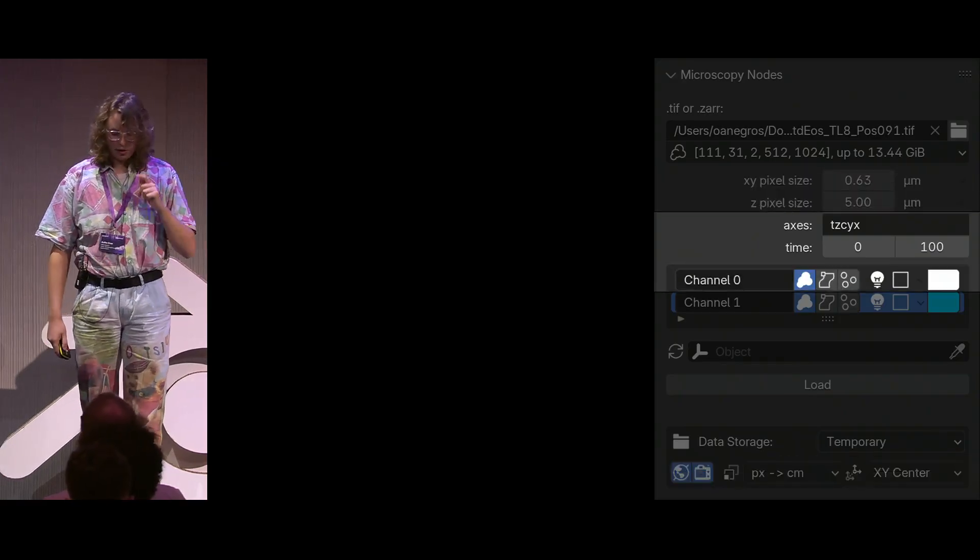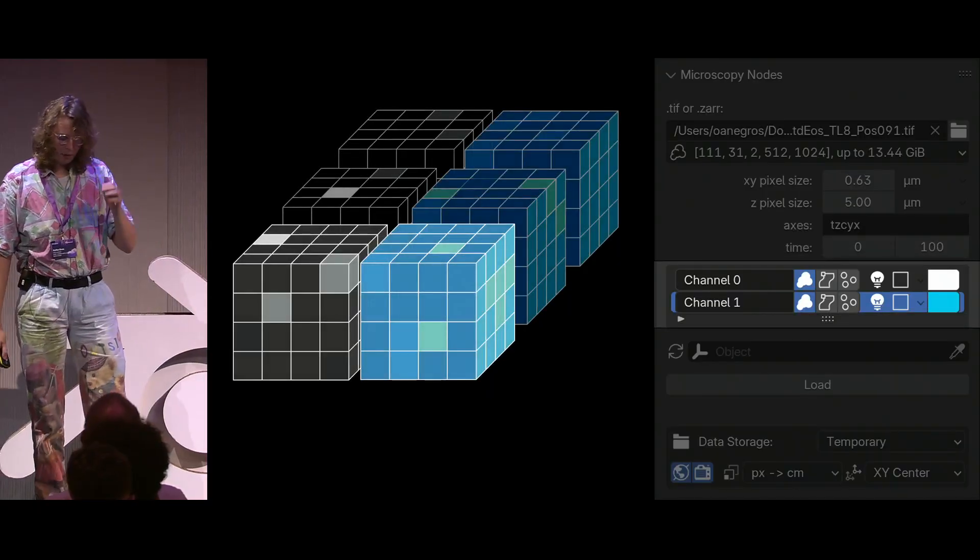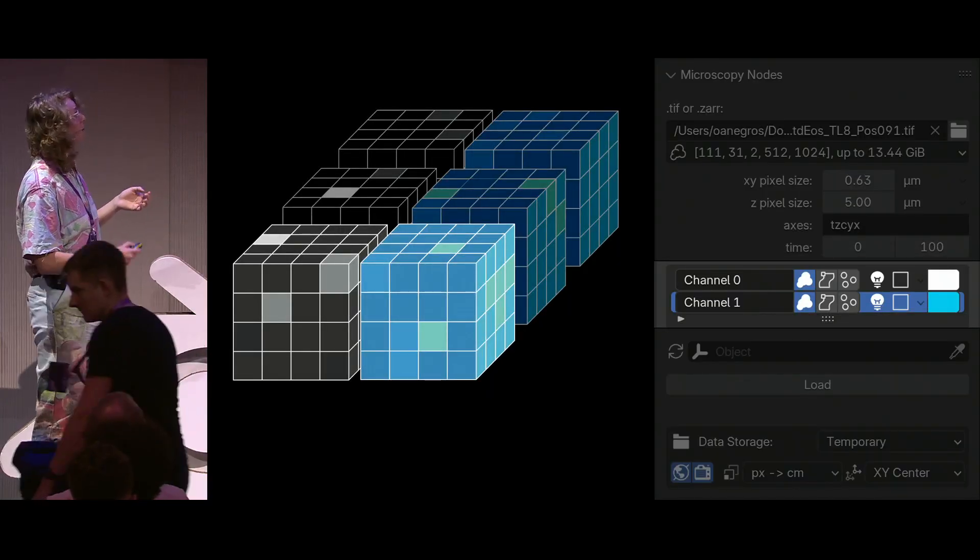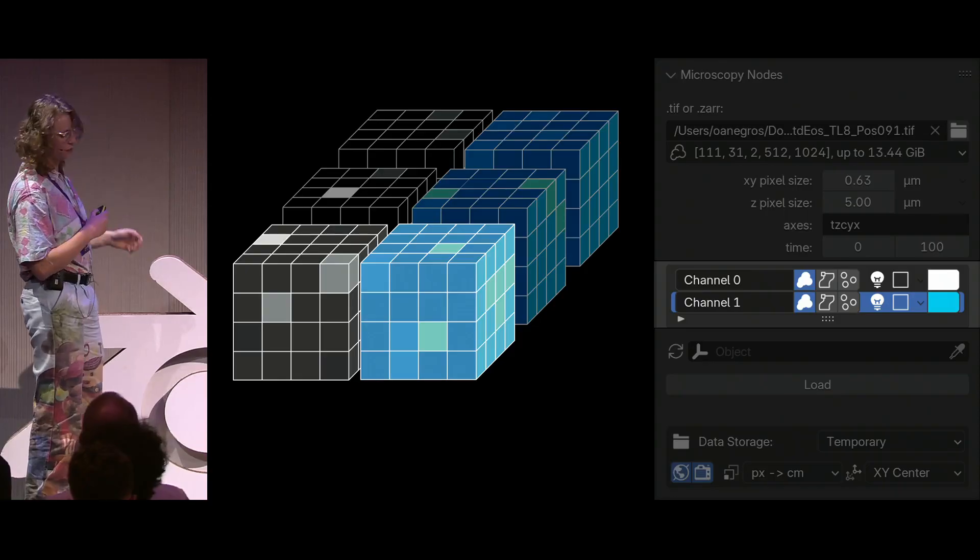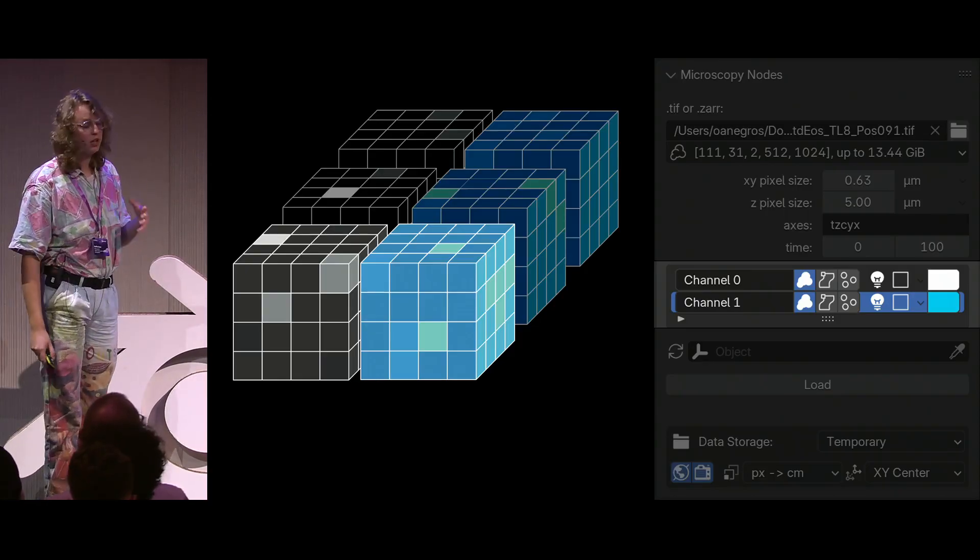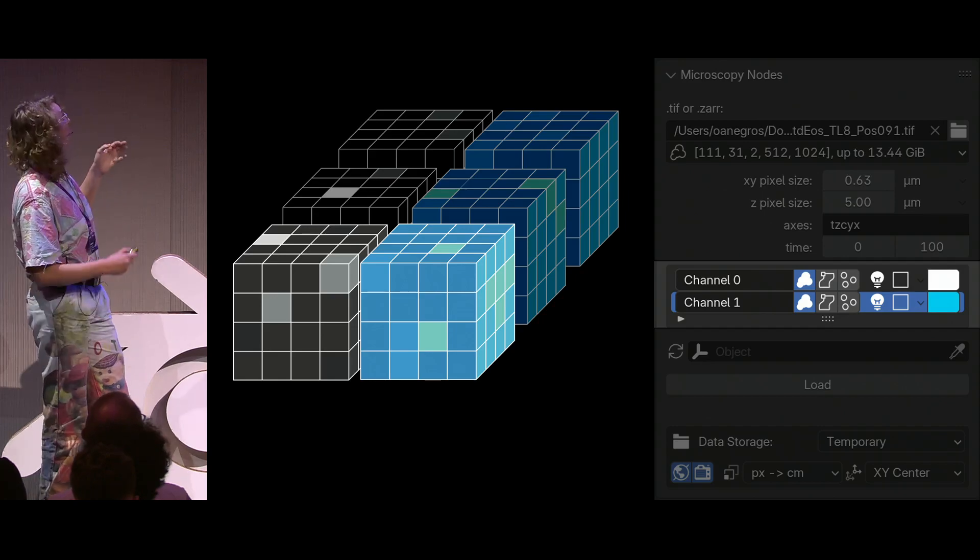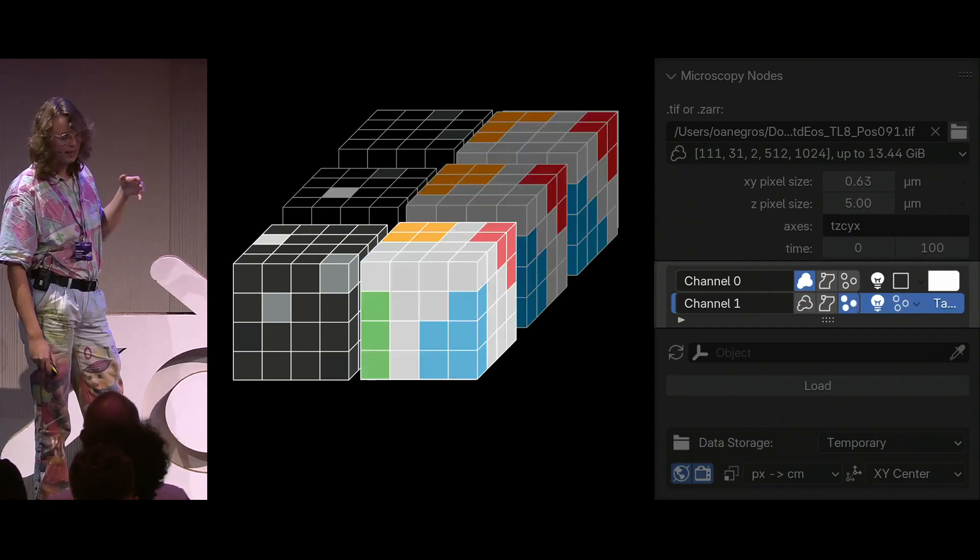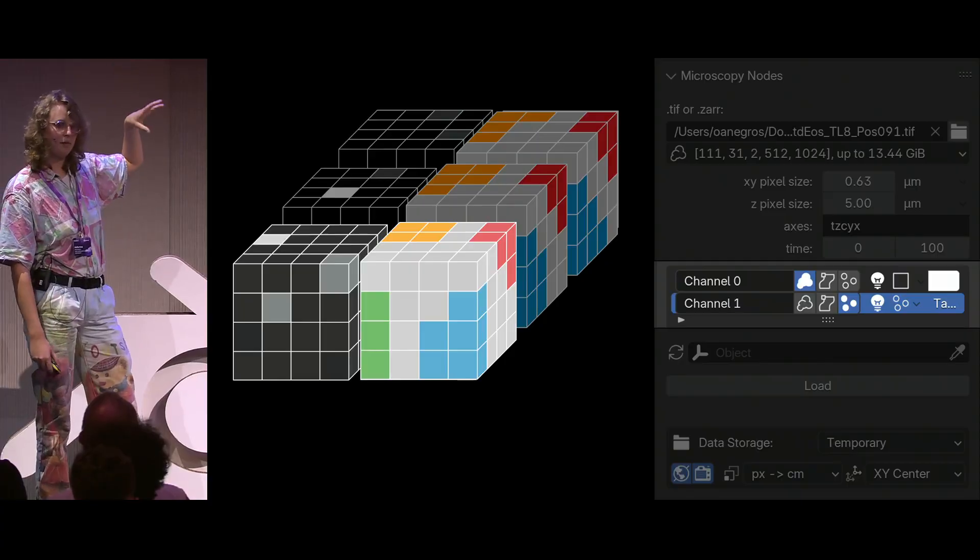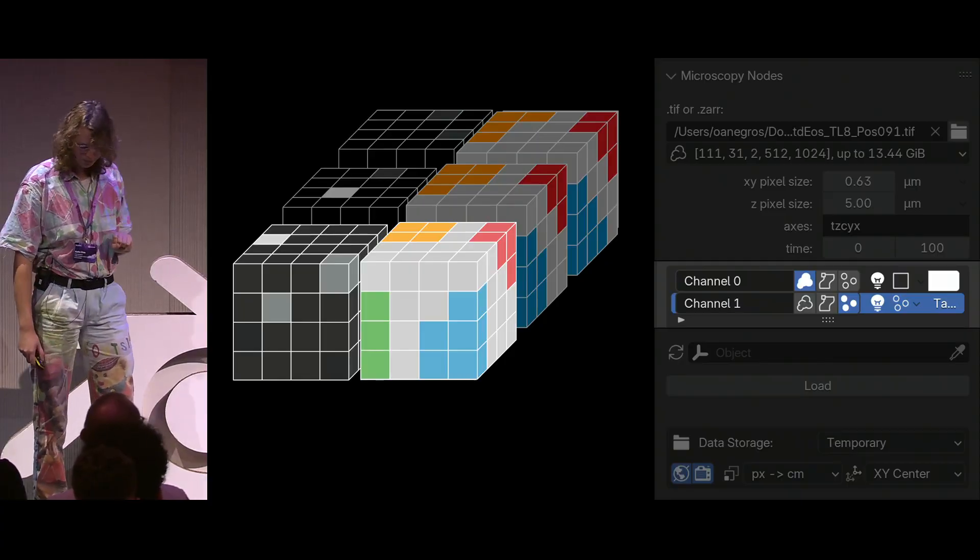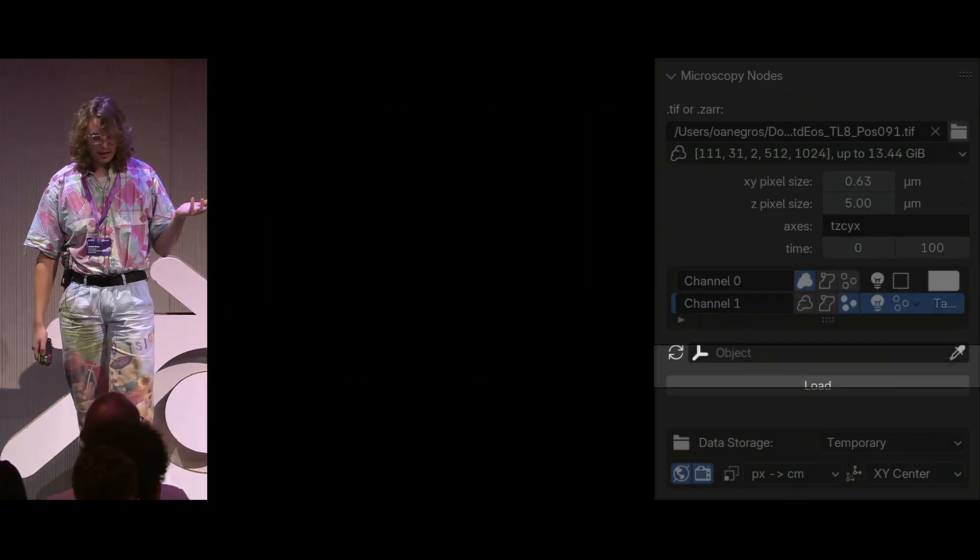And then there's the last part, which is the channel interface, where you can select here, for example, which colors each of your channel shall be, but you can also select how to visualize them. It can be as a volume, or as a surface, or as a label mask, where the label mask will take these separate regions and make meshes for each of them. And then you can load your data.